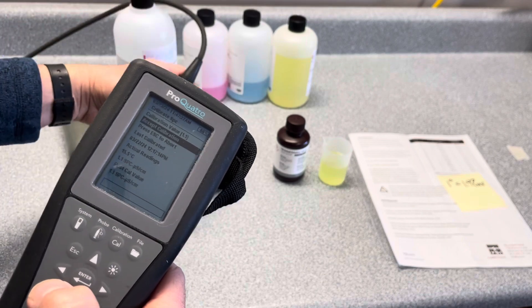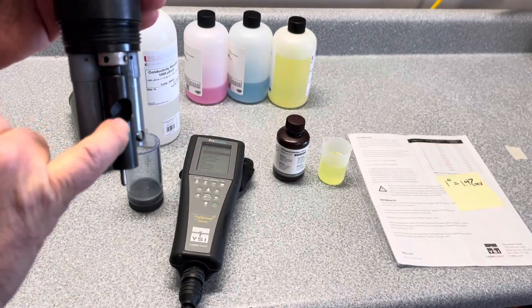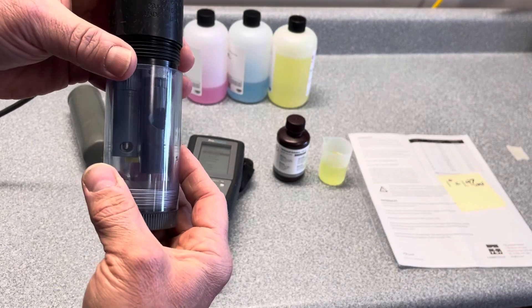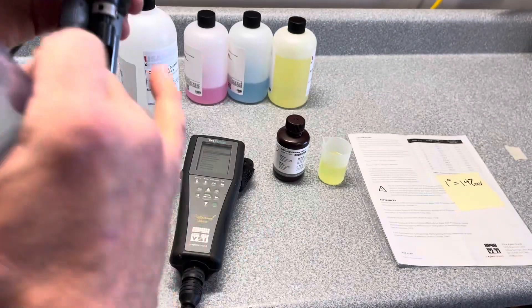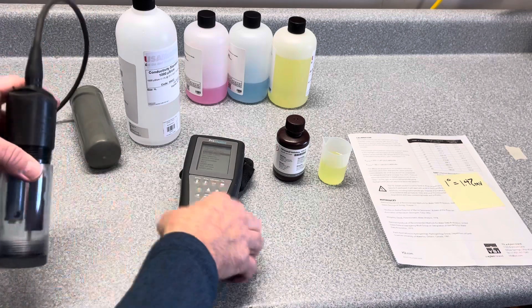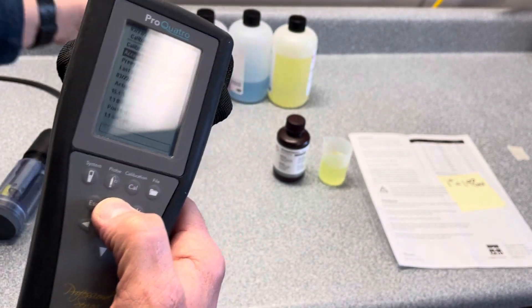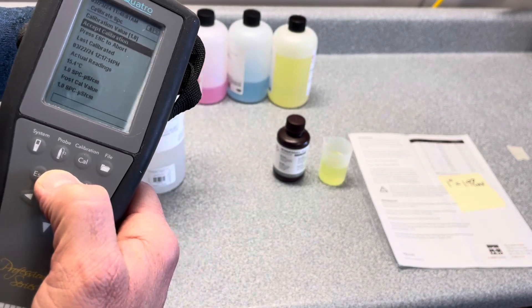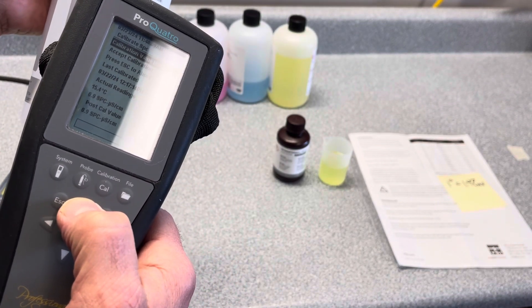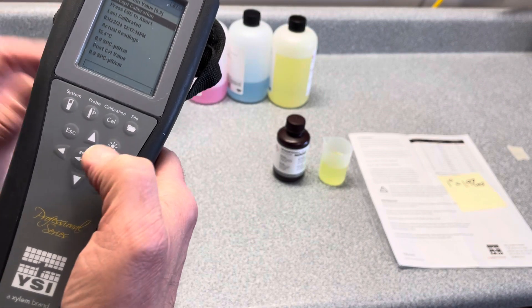Then you would have the probe soaking in the conductivity standard. You want to make sure the solution goes above this port here, so whatever calibration chamber you use needs to be higher than this port for conductivity. Then make sure your calibration value at the top is going to match. If the meter doesn't automatically recognize it, toggle up and enter 1000, just as it shows on your bottle. Let it stabilize, then hit accept calibration.